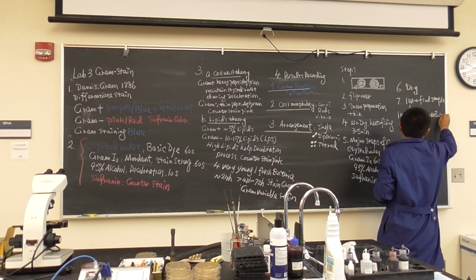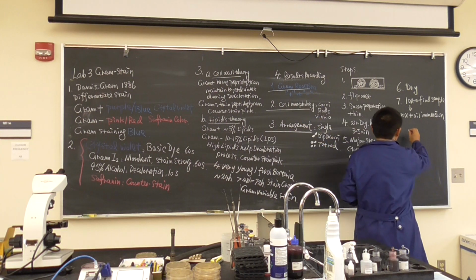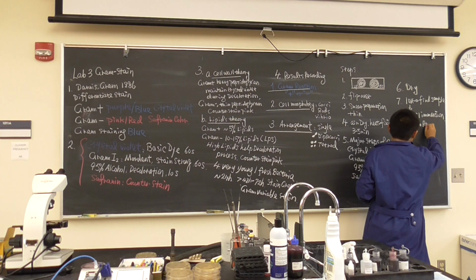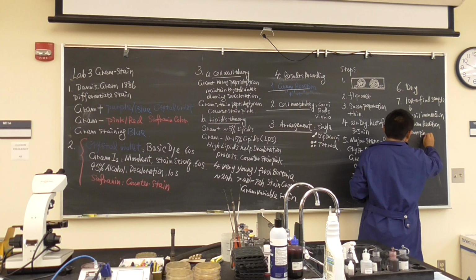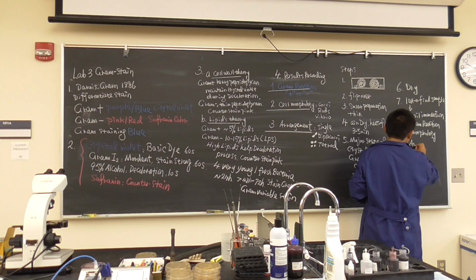And we want to see 3 important pieces of information here: gram reaction, morphology, and arrangement.